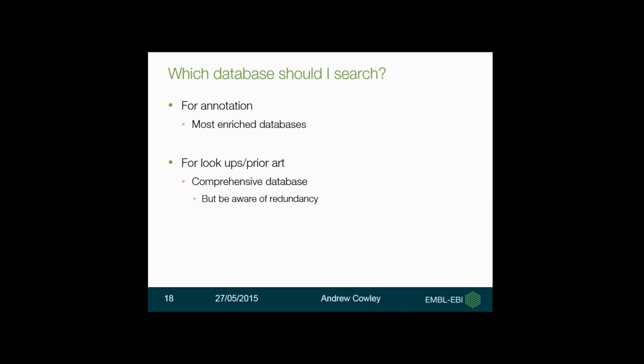You can also add in redundancy when you're selecting the databases, because we allow you to select more than one. So just be careful that you're not selecting, say, all of UniProt plus the SwissProt section of UniProt, or the TrEMBL section of UniProt, because you're selecting the same data twice. Now, behind the scenes, we try and deal with that, so it shouldn't matter too much, but it does look a bit silly if you then reference your search and you say that you searched the same bit of data twice.